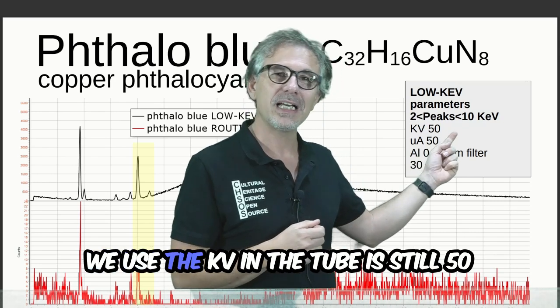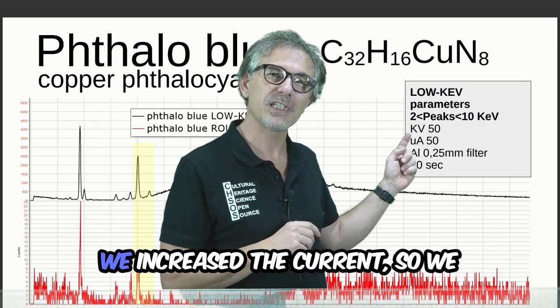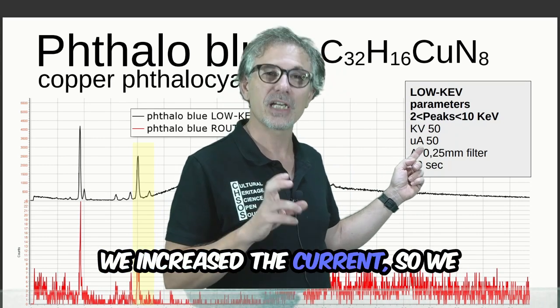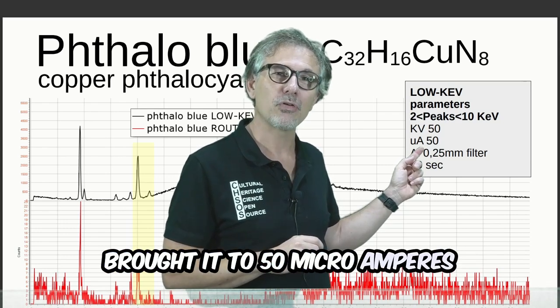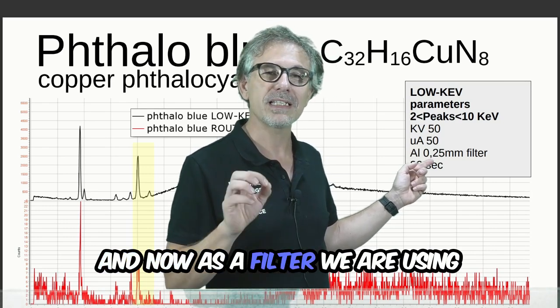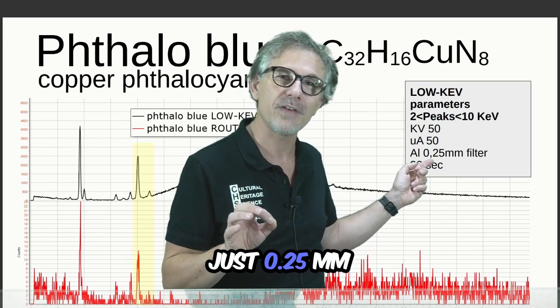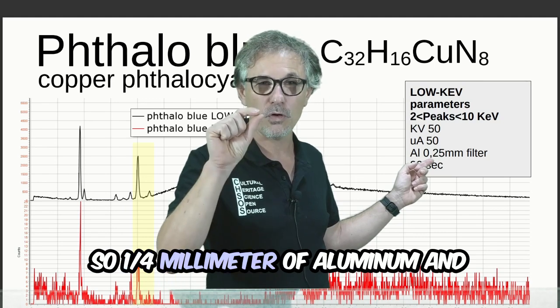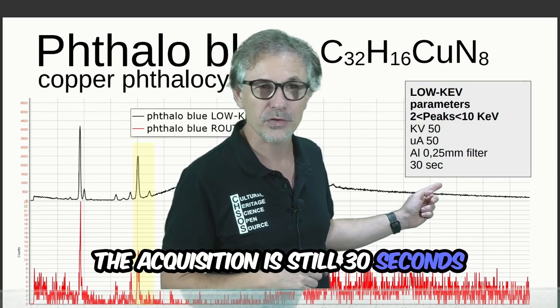The kilovolts in the tube is still 50. We increased the current, so we brought it to 50 microamperes, and as a filter we are using just 0.25 millimeter, 1/4 millimeter of aluminum, and the acquisition is still 30 seconds.